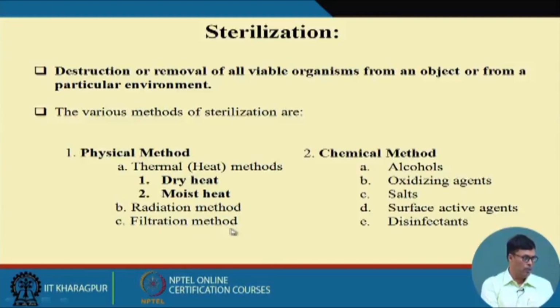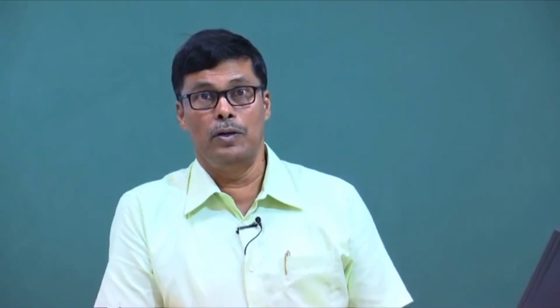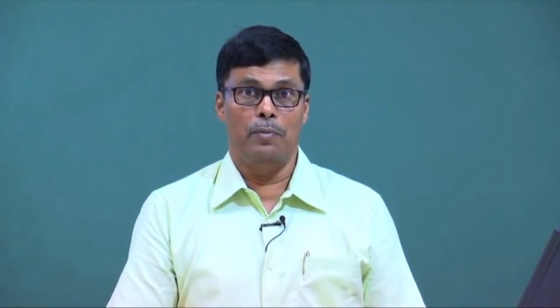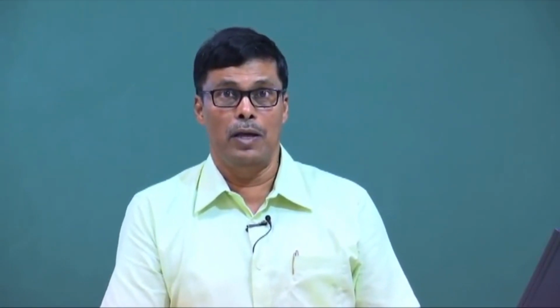Now again, when we use the filtration method, as you know, your media comprises a lot of nutritional components like vitamins and amino acids. These vitamins and amino acids are very sensitive to temperature.